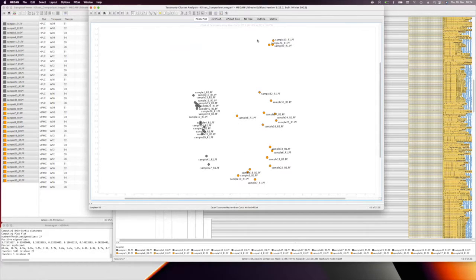This group is a bit more spread out. But what's also quite nice, I don't know if you can see this in the video, is that PC1, which is this component, is quite strong, 62%, and is exactly separating the samples by diet. So this is quite nice in terms of the data set.